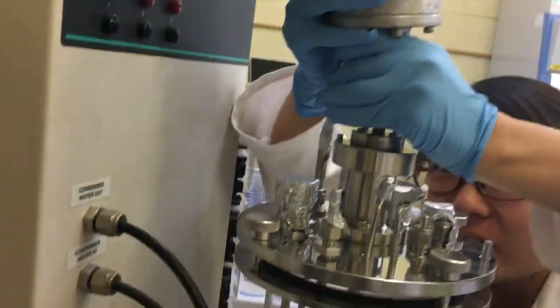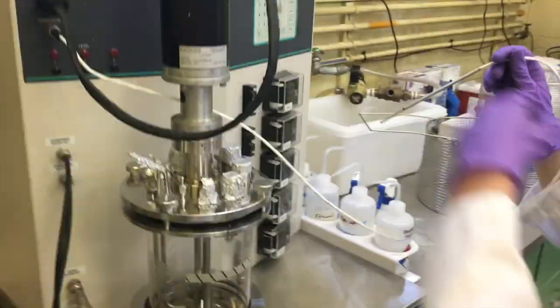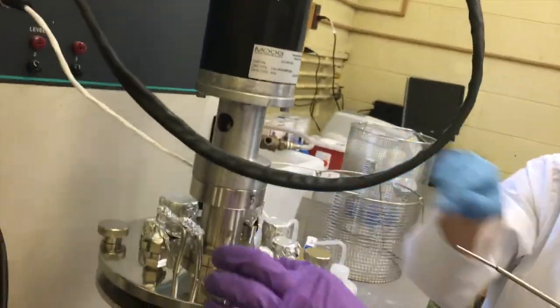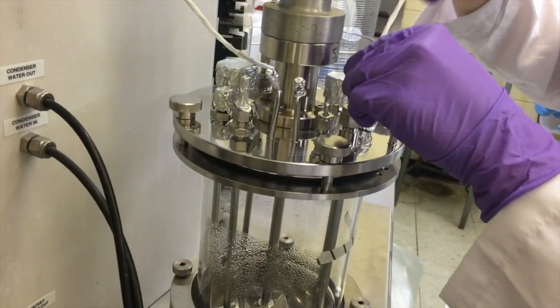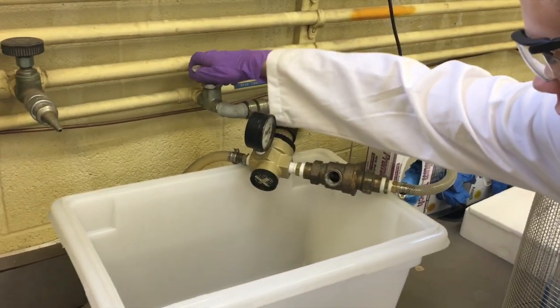Attach the agitation motor to the reactor assembly. Run the temperature probe into the reactor. It must reach the bottom of the reactor to measure the sample temperature and not ambient temperature. Turn on the water source above a bucket for catching leaks.